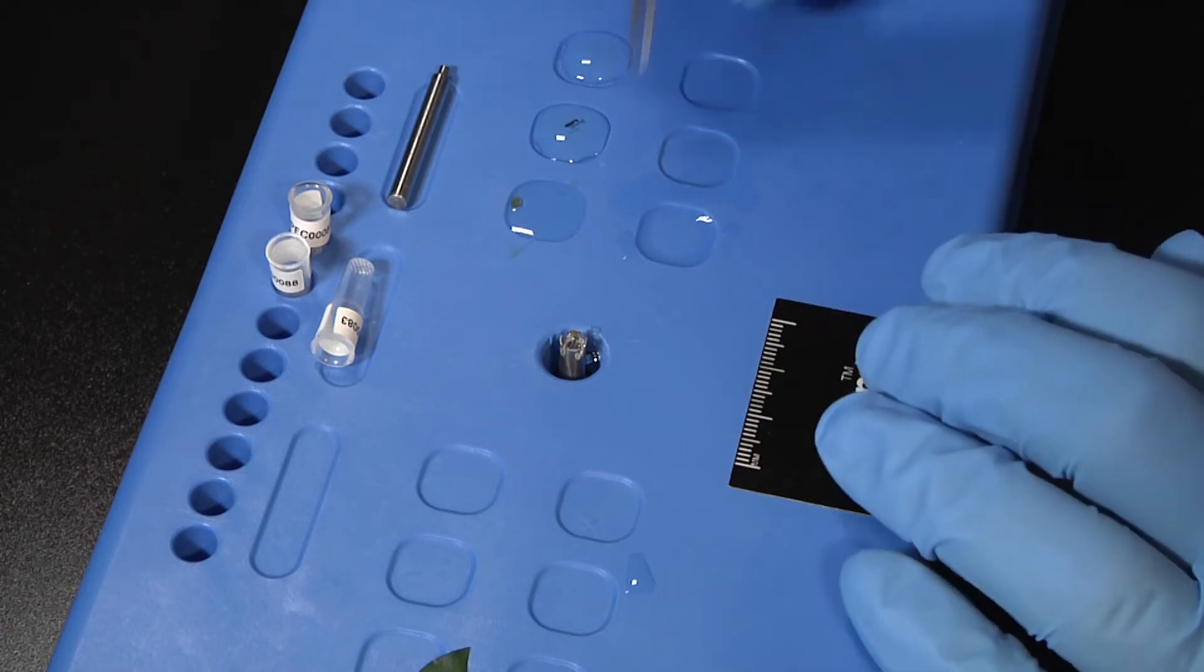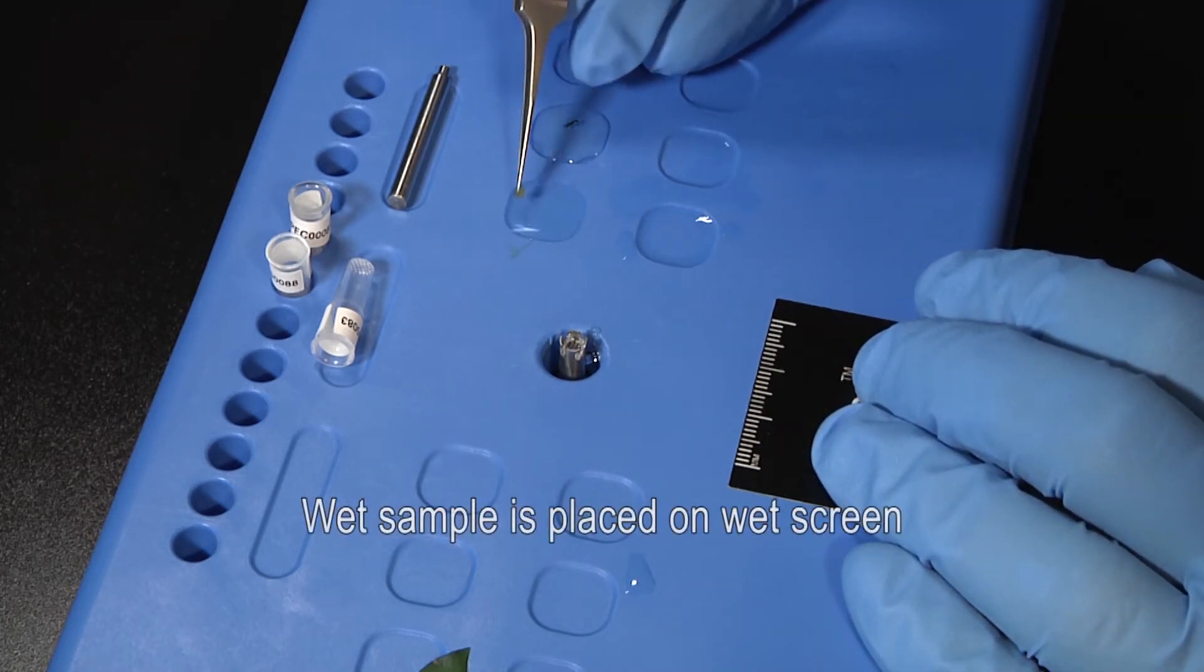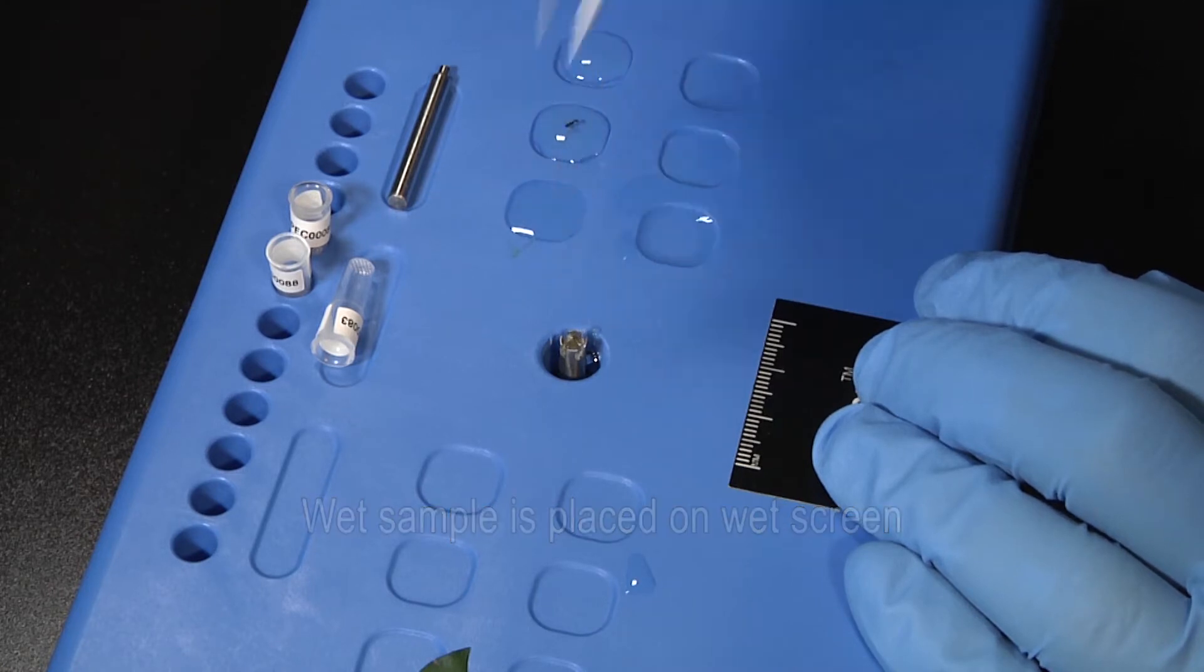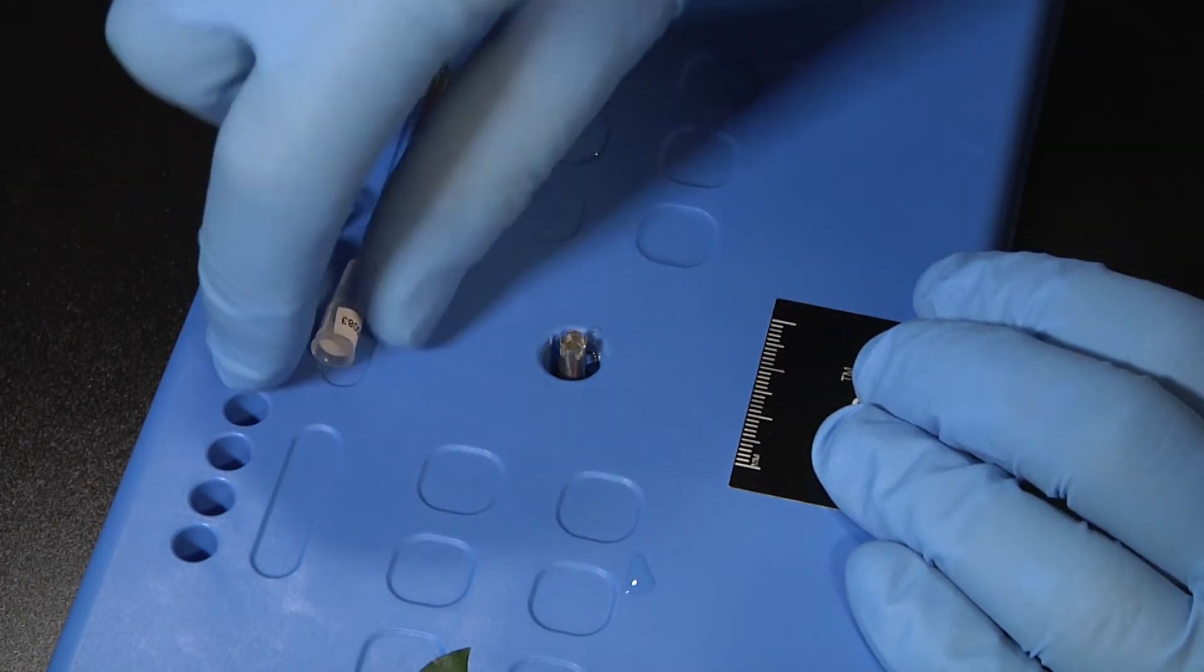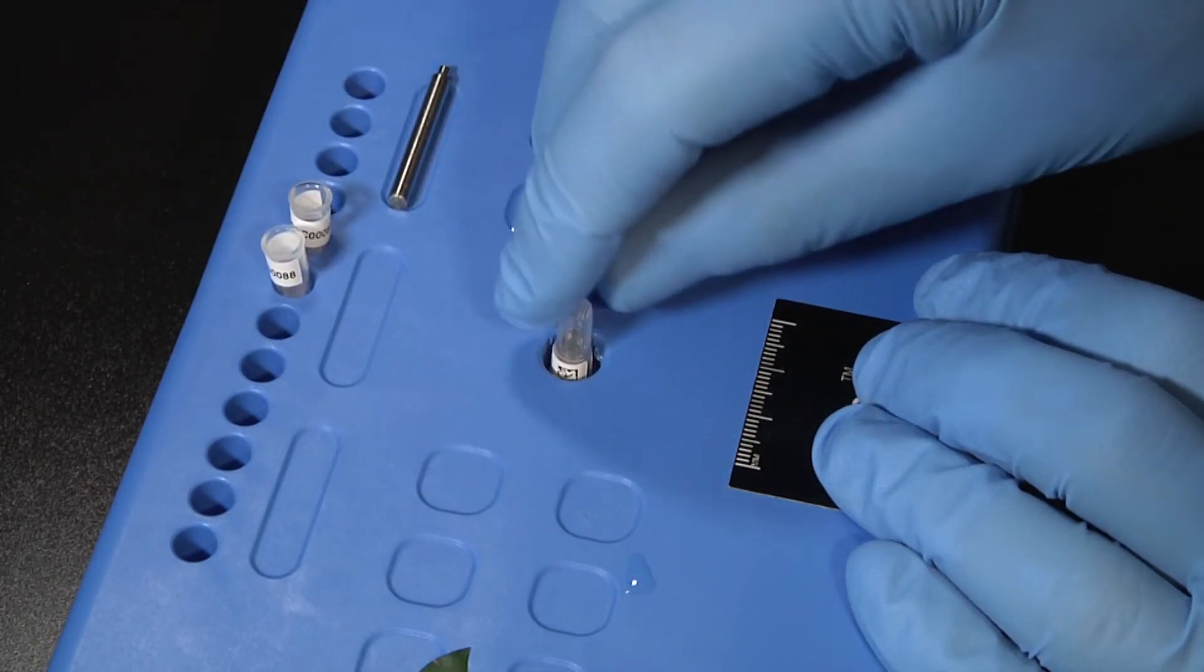A wet sample is placed into the concave cavity of the screen. An empty capsule is then slid over the screen and insertion tool, and is rotated counterclockwise to remove the screen.